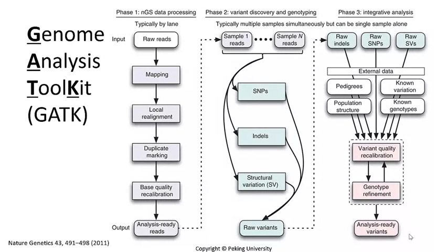Our TAs have filmed a special video for the commonly used read mapping tool BWA and the genotyping software GATK. This video will explain the basic ideas and usages of these tools and is uploaded as a supplementary video.